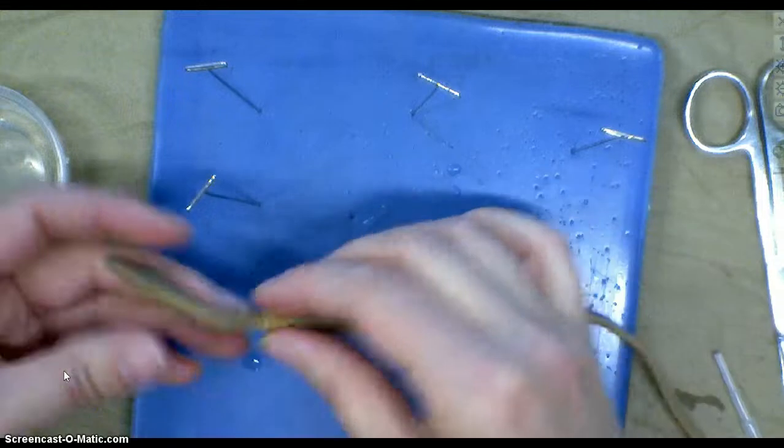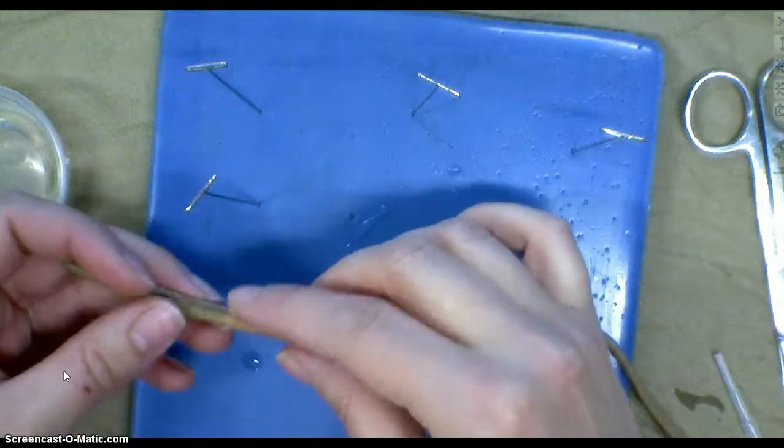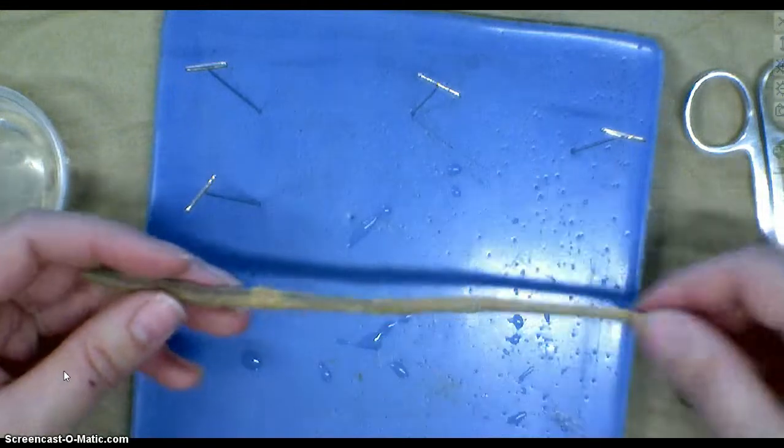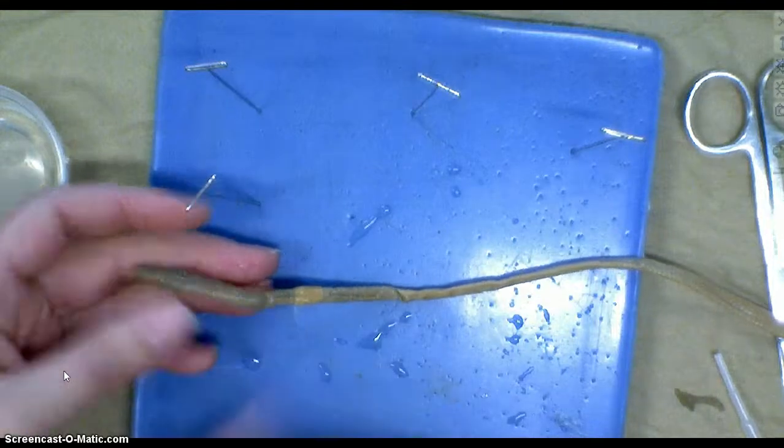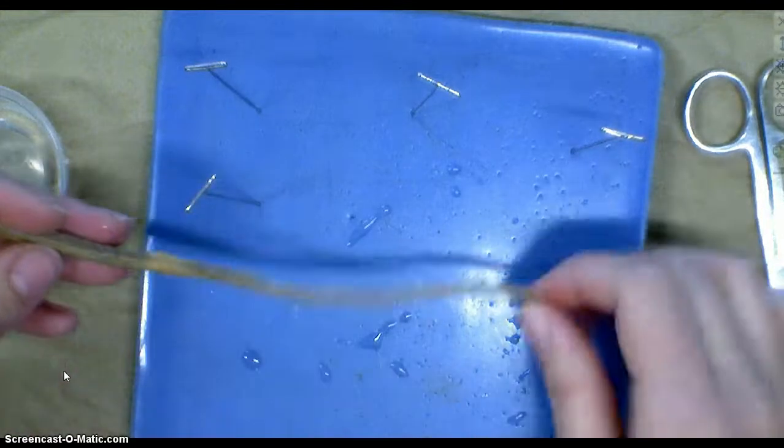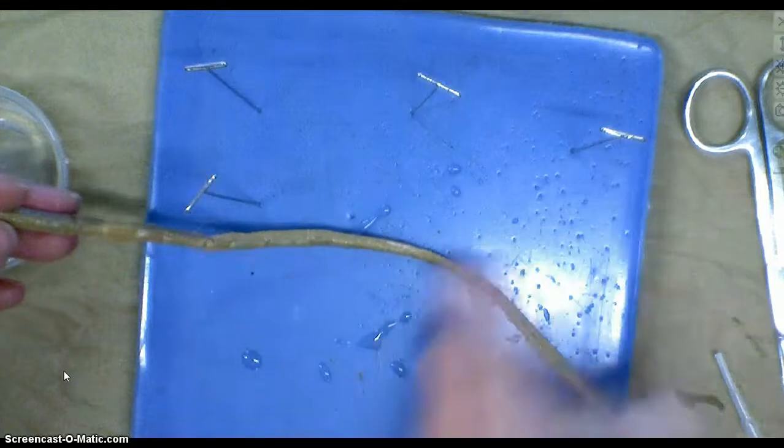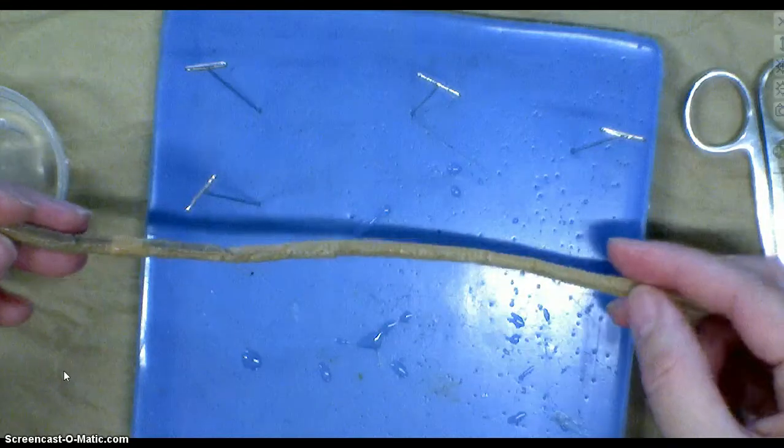Now this little structure here is called the clitellum, and it is always closer to the head end. Everything of importance is from the clitellum forward. There is nothing new from here to the back. It's just one long intestine and one long vein.